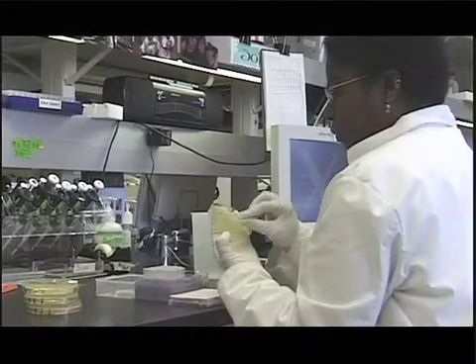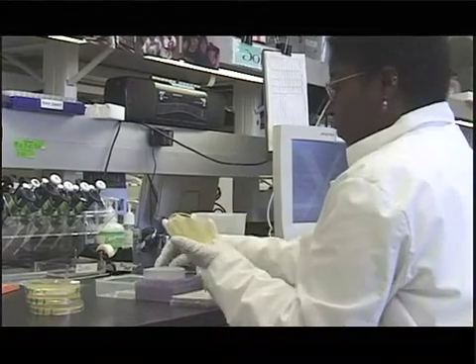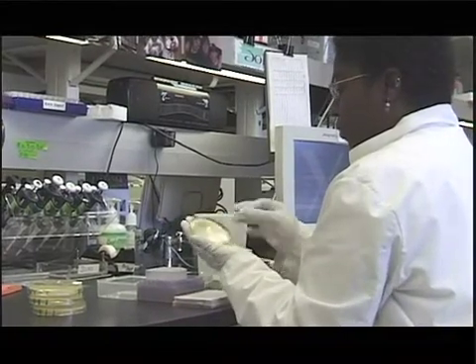So now we're in library core. How does the BAC DNA get from mapping core to library core? Well, a technician from mapping core streaks the bacteria containing the selected BACs onto small agar plates.